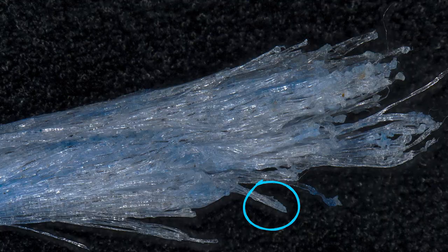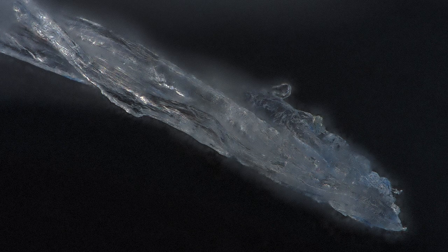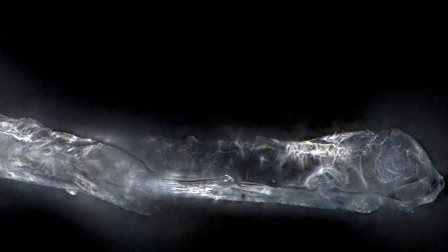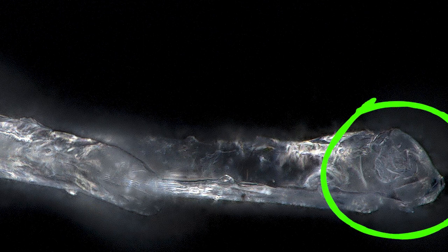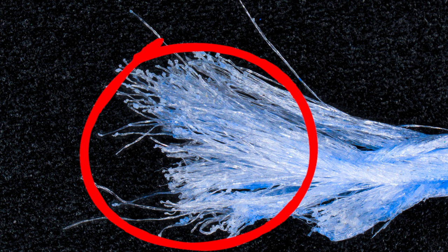Let's zoom in on this area at 200x magnification — all of this area showing evidence of cut braid. Looking deeper at 700x magnification, the fibers are all cut off in an angular slice direction and seem to be slightly fused together at the tip. At 2,000x magnification you can see two fibers clearly showing evidence of being sliced — look at that nice angle cut. Now looking at sample two of the braid knot failure, we can see two areas very clearly: one showing evidence of being cut or sheared, and this area mostly showing evidence of a single line snap.